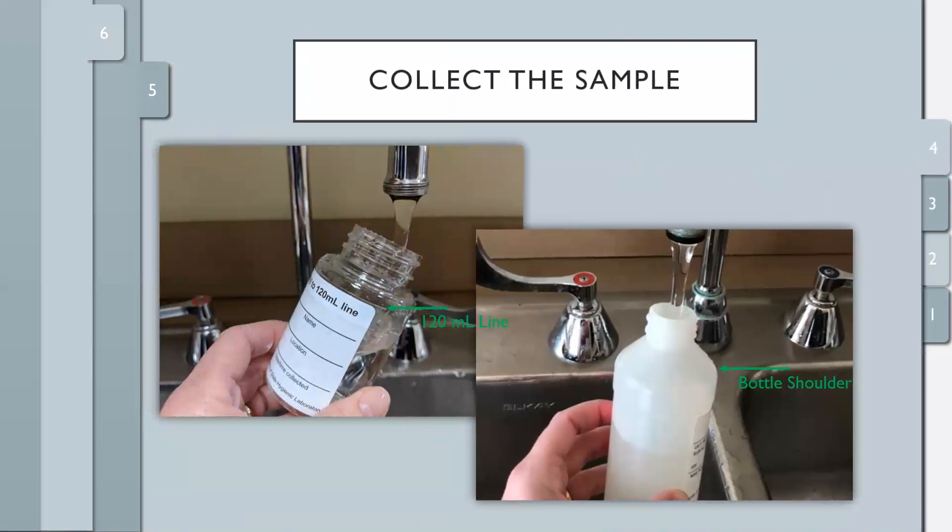Now you are ready to collect the sample. Carefully open the bottle without touching the inside, keeping the lid in your hand. Reduce the water to a gentle stream so it doesn't overflow as you fill the bottle. Fill the bottles to the designated mark.